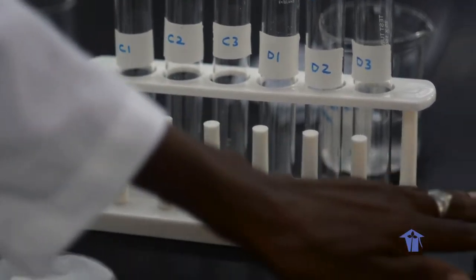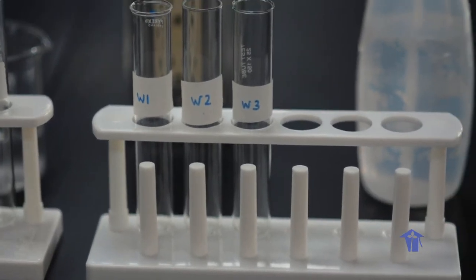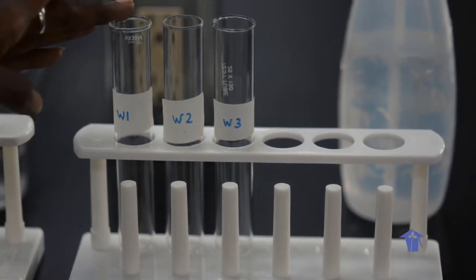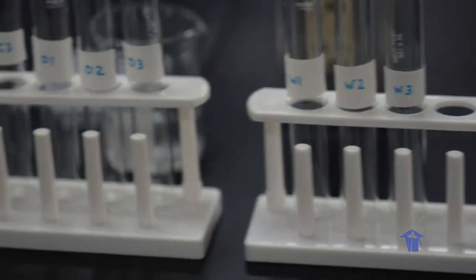And finally, over here, we are going to use distilled water in our final batch of potatoes and put them into, again, 1, 2, and 3 boiling tubes.